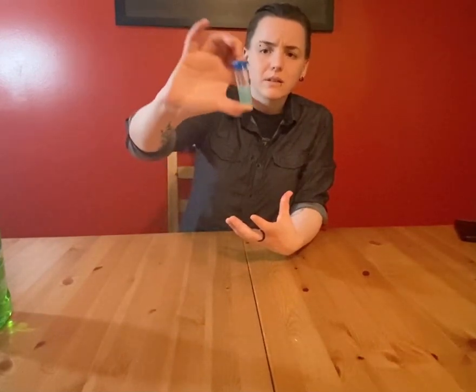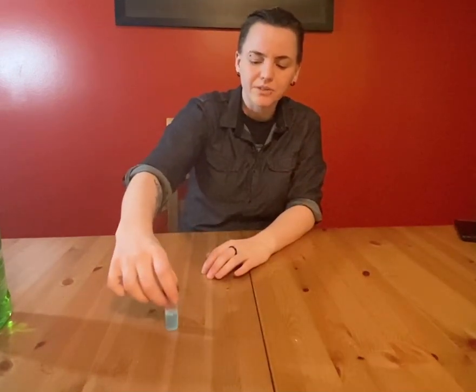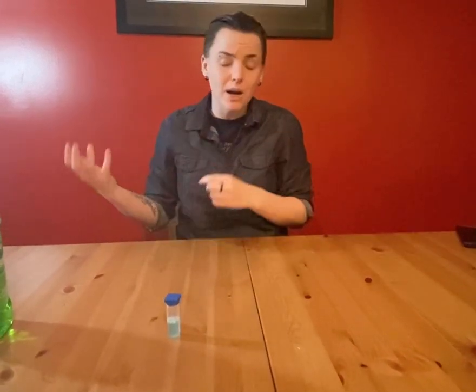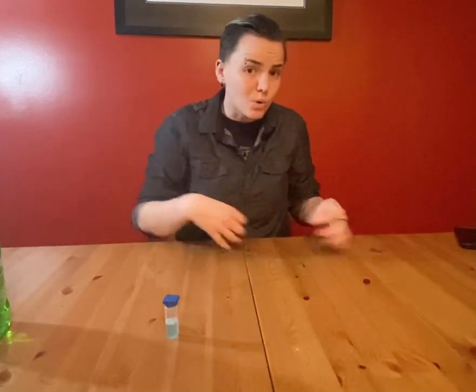So, piggybacking off of this, while we wait for our little cells to dissolve here: the reason why we look the way we do, why I have blue eyes, why other people have brown eyes, why you're right-handed or left-handed, is because of having dominant or recessive traits.